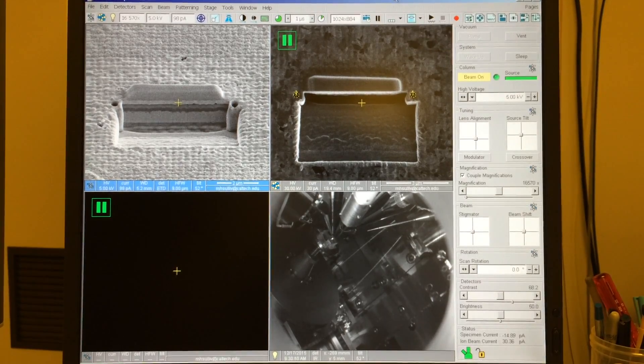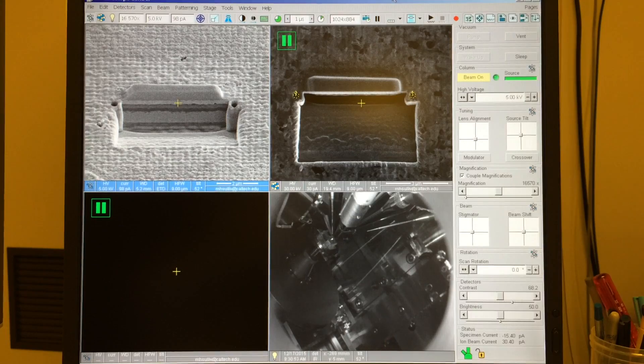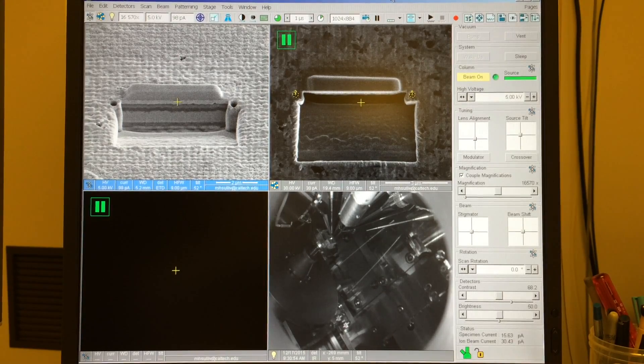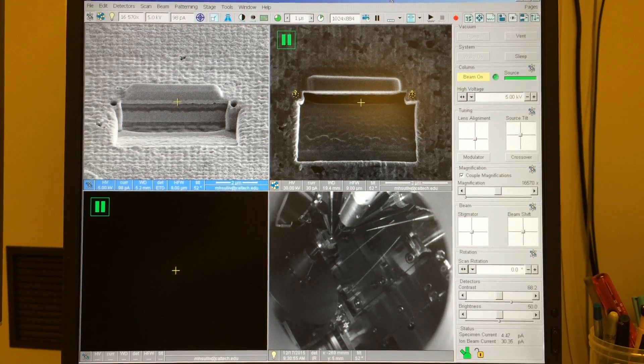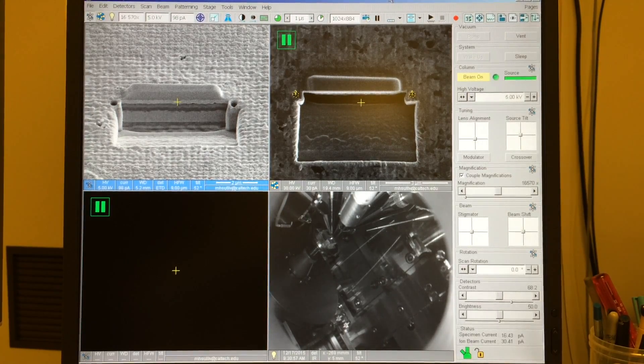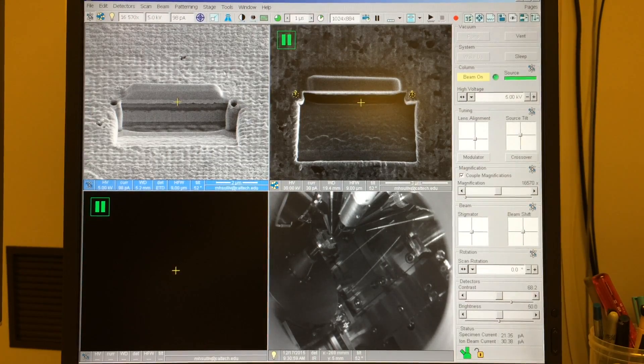In the second video, I'll show how to perfect that alignment using the alignment rectangle technique. And in the third video, I'll show how to best optimize brightness and contrast, and then frame and capture the final image.